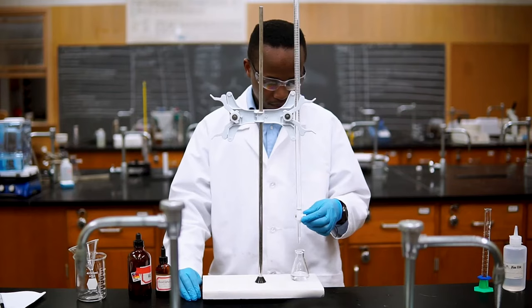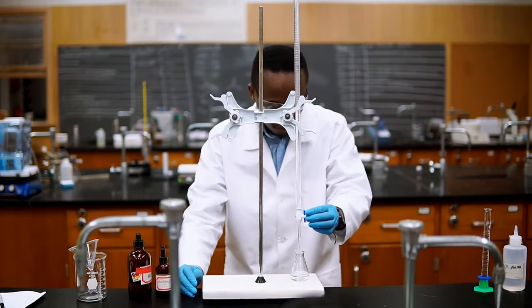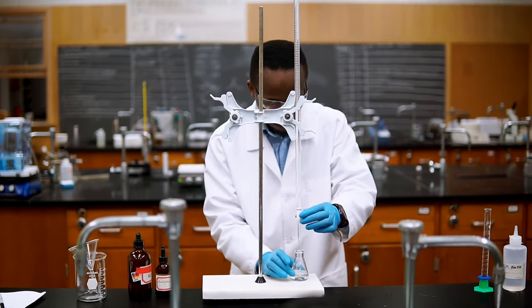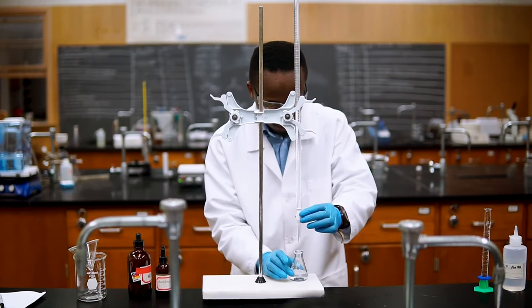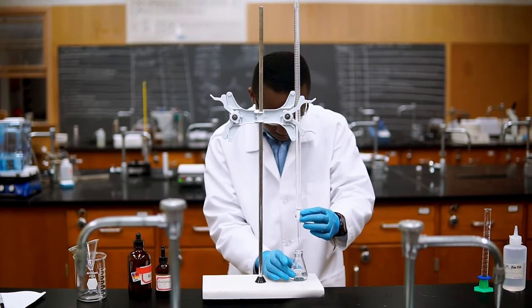We will start with what we call a rough titration, or quick and dirty titration. This is a quick run to get an idea of where our equivalence point will be. This rough titration saves a lot of time, but it is not very accurate so we won't use this data in our results.